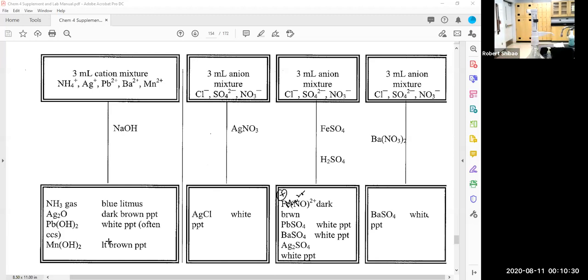I'm going to dump that. Okay. So, where does that leave us? That leaves us with 3 negatives. But we have to have an ion in there, so I'm still thinking that the brown ring test didn't work successfully. I'm going to redo this one. I'm going to dump this into the sink, and clean that test tube.